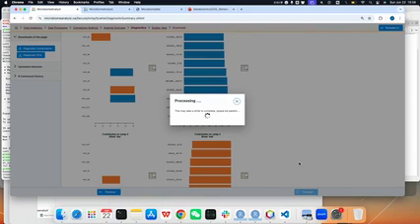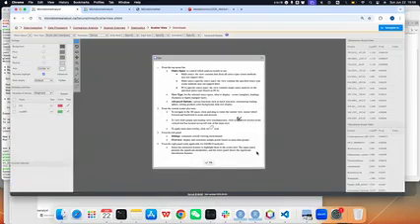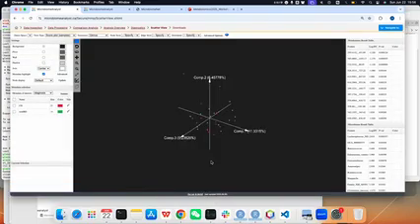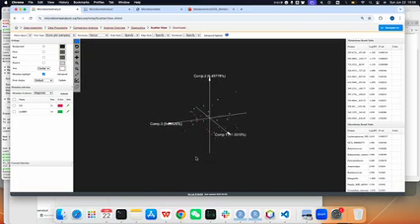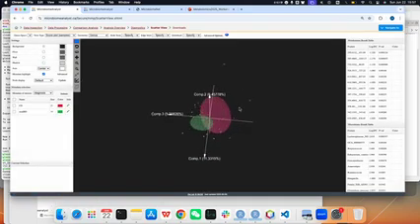Here we have the same visualization technique as Procrustes. Can people download the loadings and the figures? We can download the figure. The loadings, I'm not quite sure, because that's something downloaded from here. Yeah, no, here it's download only. Then, oh, you can just submit this to have a clear view.